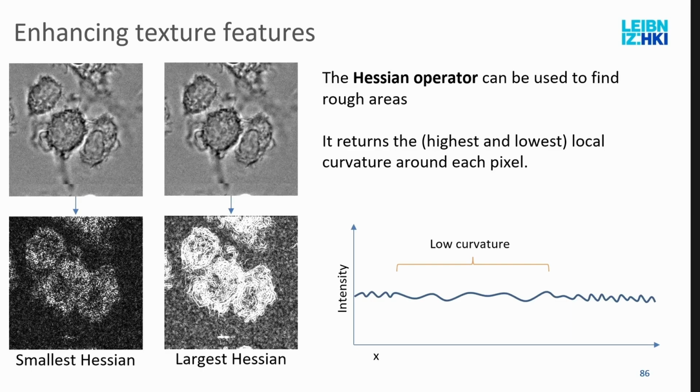And then what he actually does, and I don't show it here, is apply a Gaussian blur to this image, which blurs together all these structures because they are not of interest for us. We just want a bright highlight against the background. So this is all blurred away. Then you can just apply a thresholding, and you get a quite good estimate of the actual macrophages. And then there are special operations afterwards that can split it up, and I will list them hopefully.